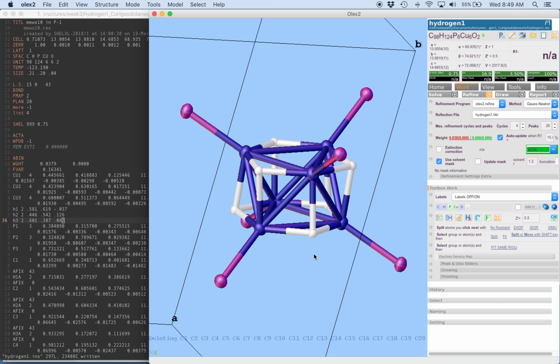So if we have a range of bonding distances of 0.06 angstrom and ADPs that are maybe slightly bigger than they should be, but they're within a couple hundredths or so of the reasonable values, we can be pretty happy with that. But we want to get some practice restraining these hydrogen atoms with different techniques. So I'm going to do a couple different things here to stabilize them.